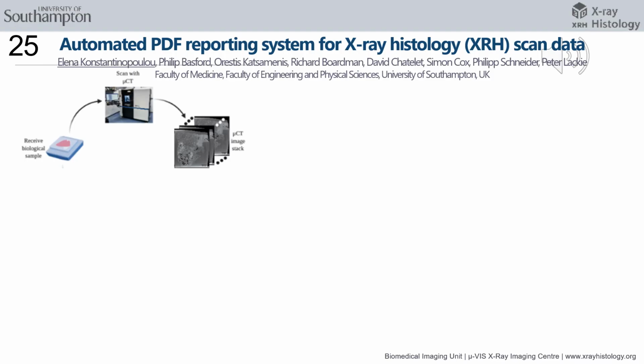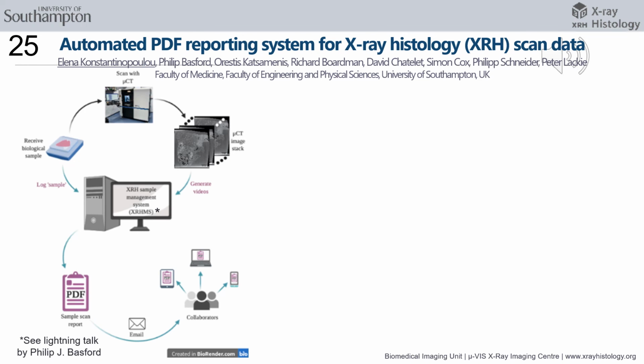Hello, my name is Elena and I am a research fellow in medicine at the University of Southampton. In our X-ray histology facility, we use micro-CT to produce three-dimensional data of biological specimens. These data are then shared with biomedical researchers and clinicians who are often unfamiliar with this technology and may not have the time, expertise or resources to process and visualize them.